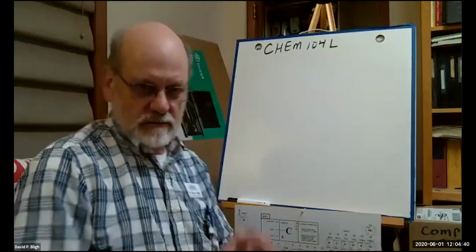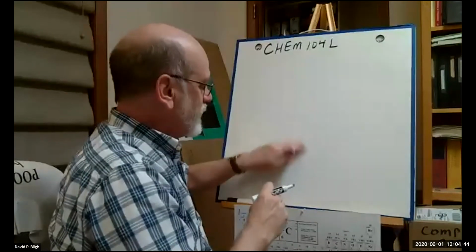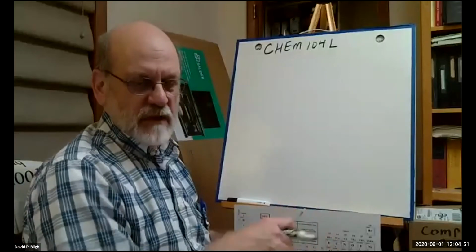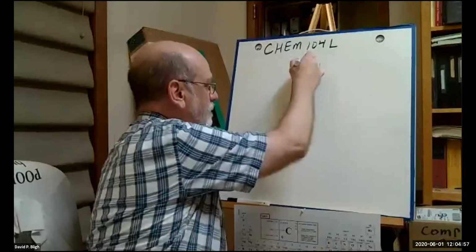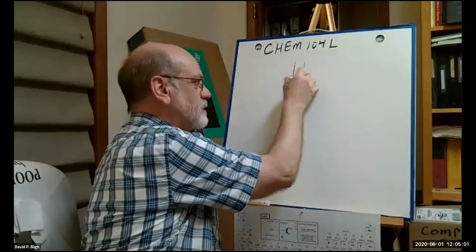You know what, I'll explain this one. When you're reading a piece of glassware in the lab, could be a thermometer, could be a burette, it has markings on it.